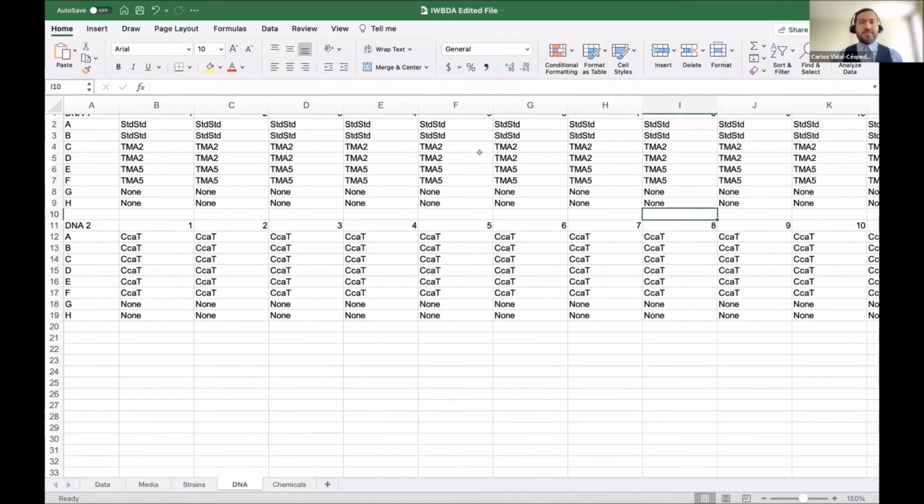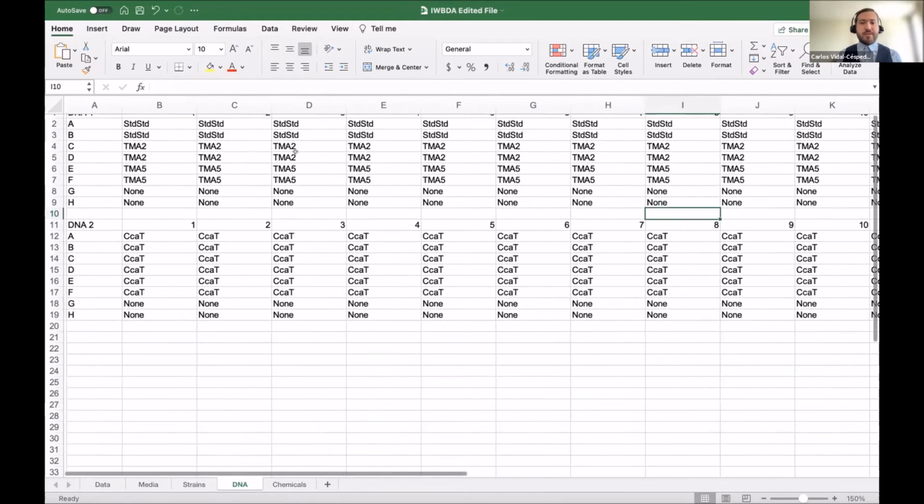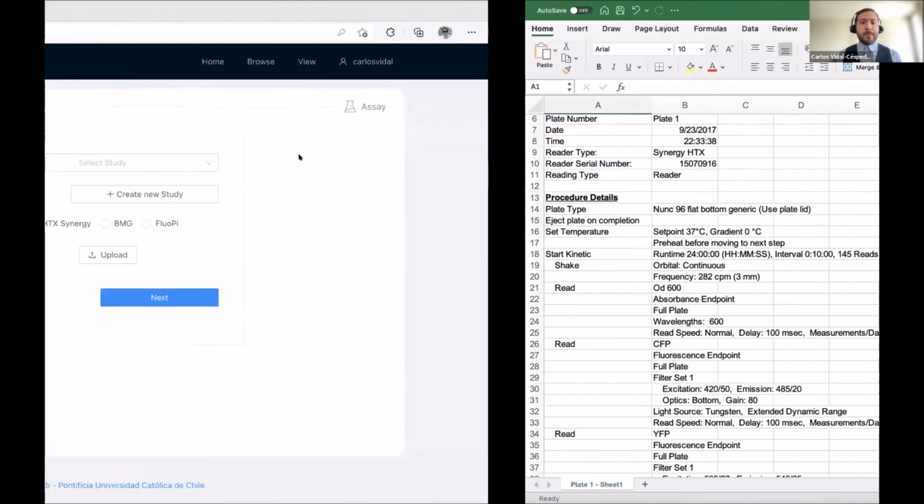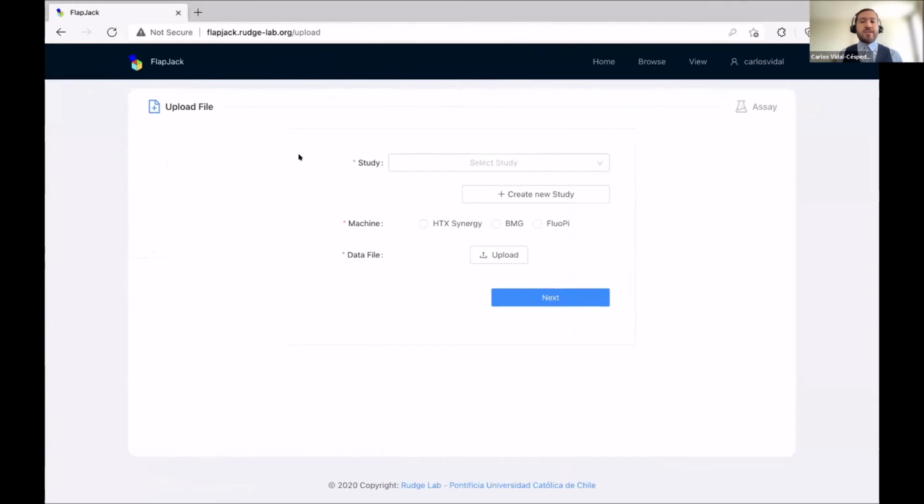Okay, I'm seeing now in the chat, they already gave you the link to the zip file. After you have done that, you get the Excel file that is ready to upload. In that case, if you want, you can just go ahead and upload following us.